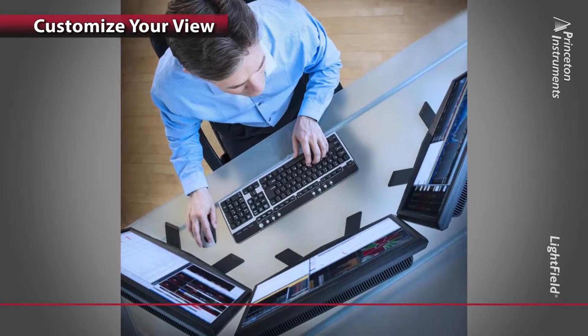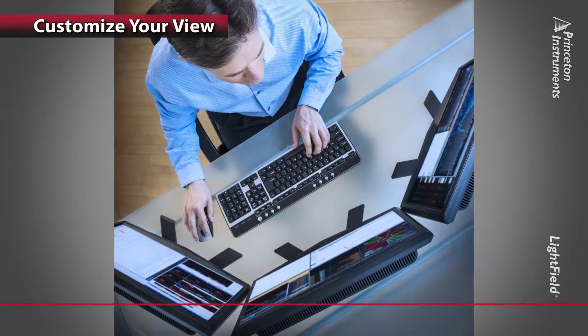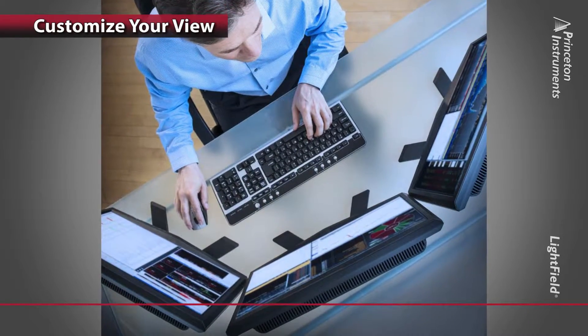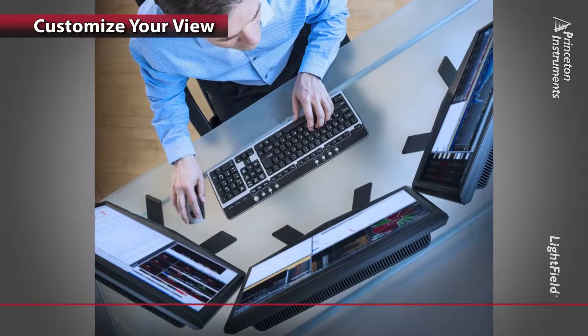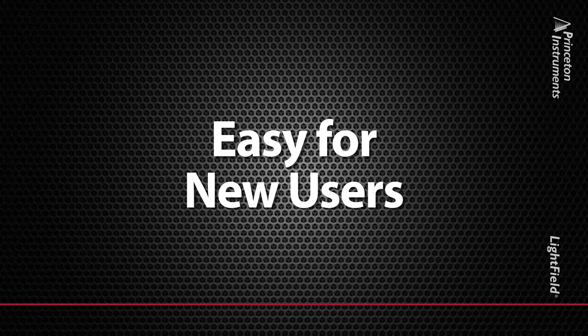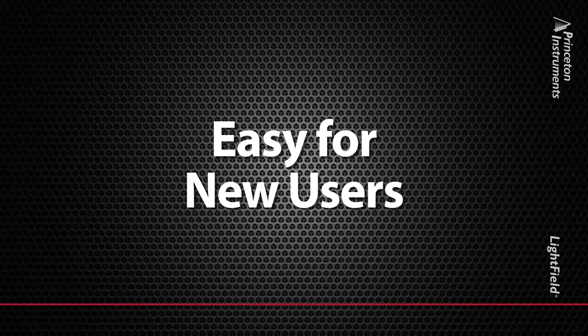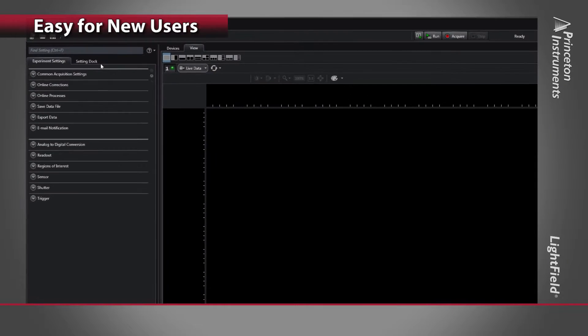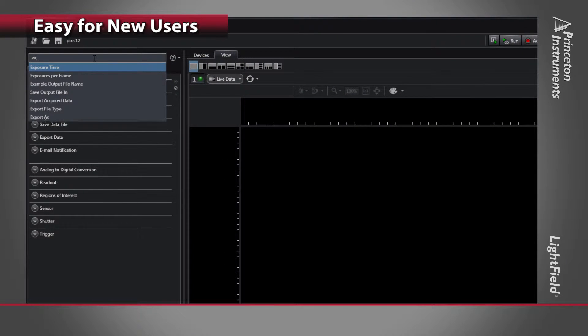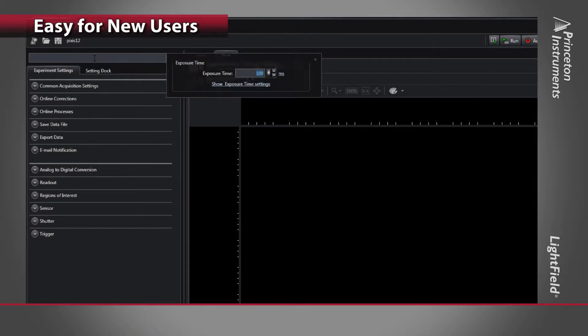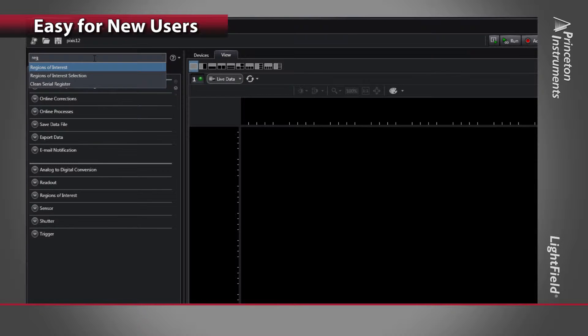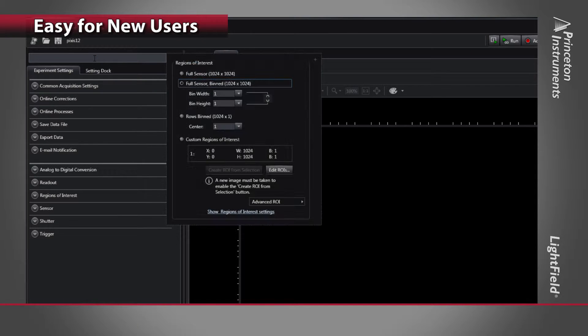Lightfield supports multiple monitors and allows you to customize the screen layout to best fit your working environment. It can take considerable time and effort to train new users on experimental setups. Lightfield's intuitive user interface makes new user training easy.